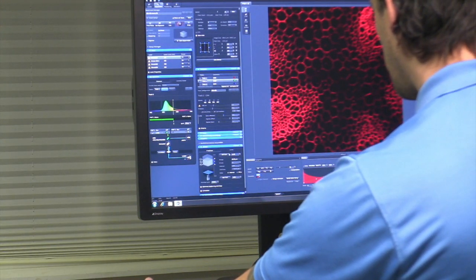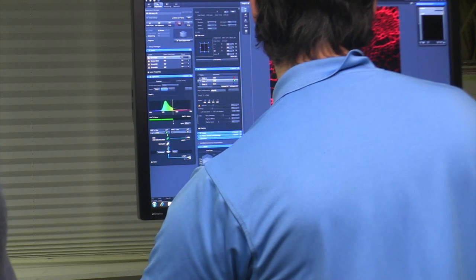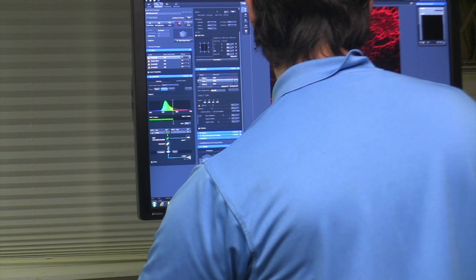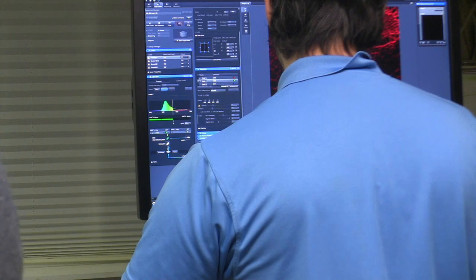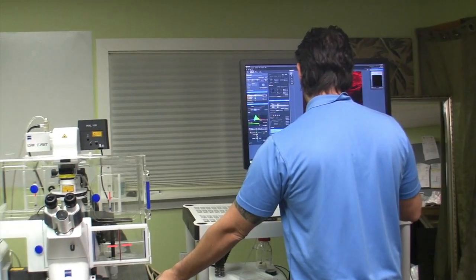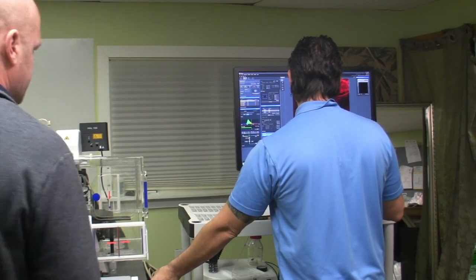So Z-stack. What level can you get down to here? Like you can't quite get to the atomic level, obviously. No, I don't know the nanometers that the 700 can separate. I can find out for you. I can look it up. It's just my curiosity.